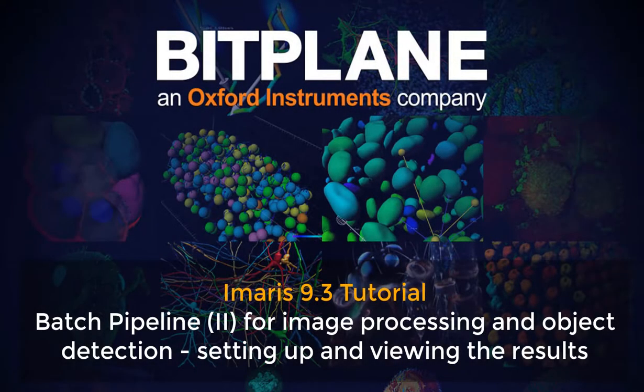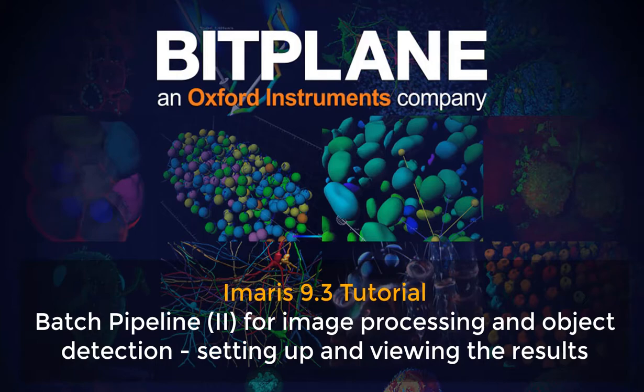Welcome to Imaris 9.3 tutorial series, Batch Pipeline 2 for image processing and object detection. Setting up and viewing the results.